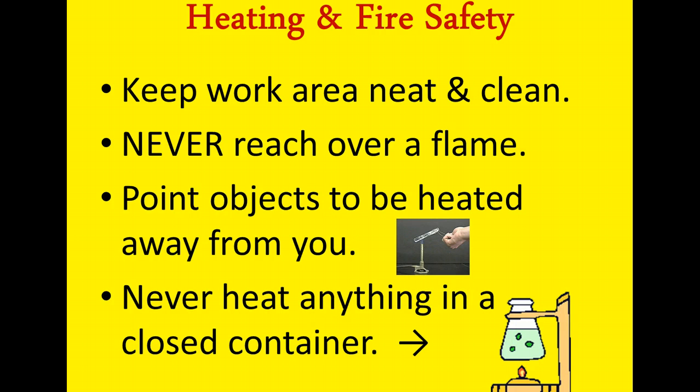Next, never heat anything in a closed container. In other words, never heat anything that has a lid on it. You know that as things get warmer, pressure builds up inside of the bottle, and either the bottle could shatter or the lid could pop off, which is extremely dangerous. So always make sure that your containers have an opening to release the pressure.